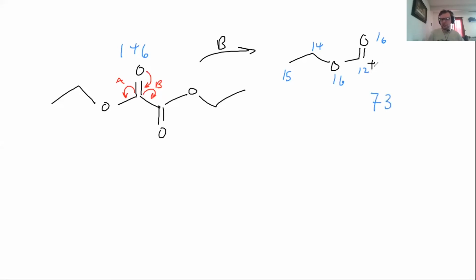Now this could change. Suppose a hydrogen sneaks in right there. That could be how we get the 74 peak. Who knows? Hydrogens like to kind of rearrange all the time. So we saw that peak in our mass spec around 74. It wasn't very large, but it was significant. So that's where we got that guy.